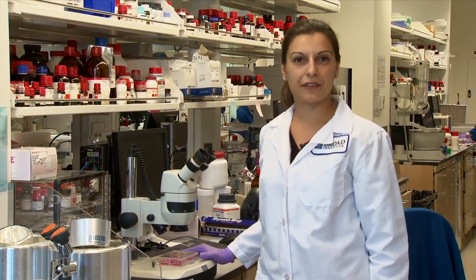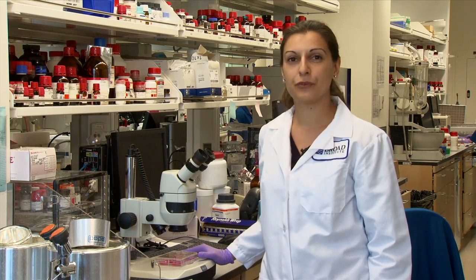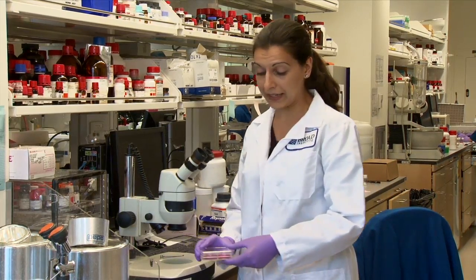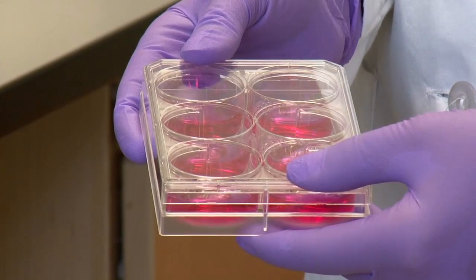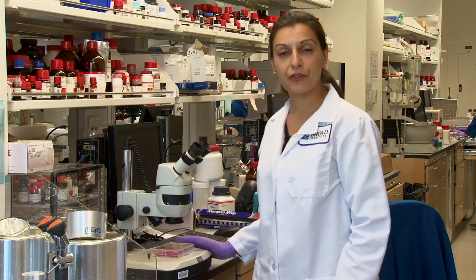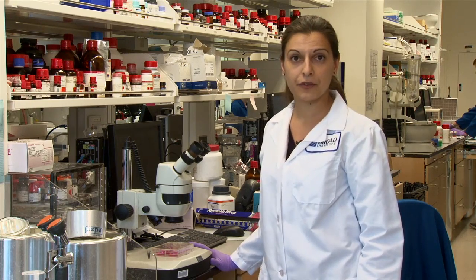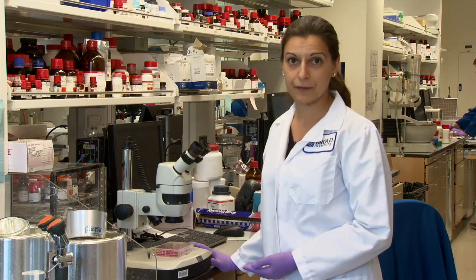So we just heard Aaron describe how to analyze a lot of data points. Now, what does one data point really mean? Here, I'm looking at cells grown in plates like this, and they're growing in their regular growth media, which looks red. And I'm looking under the microscope to see which cells are dead or alive after a treatment with a particular compound. Now, if we have a lot of data points, we can use robotic microscopes for this.